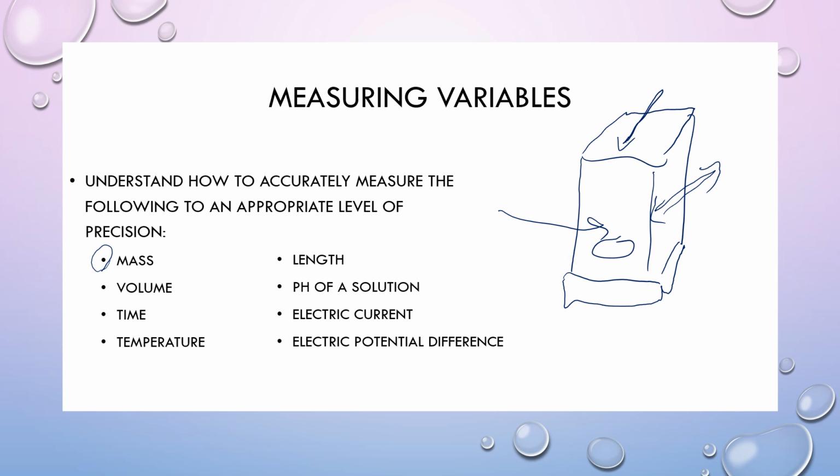And then you will open and add your measurement and then close the doors again and wait for it to settle. And then you can record your accurate measurement.